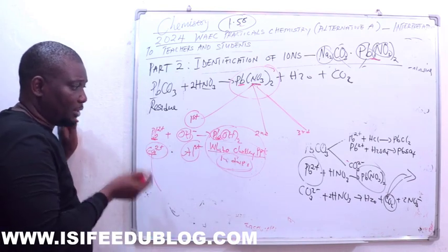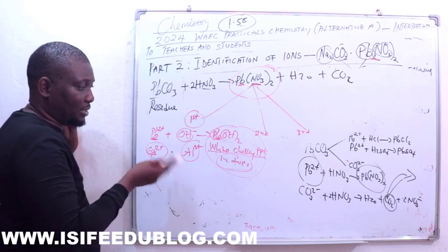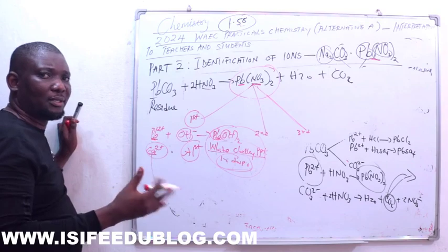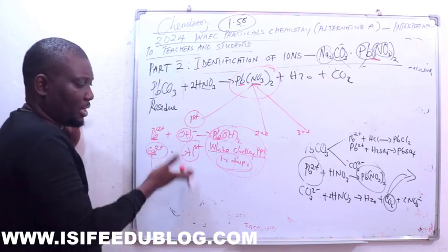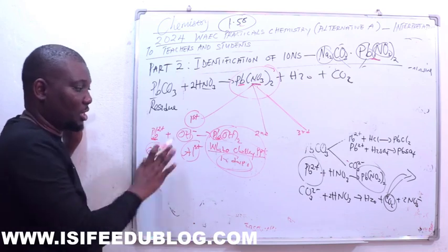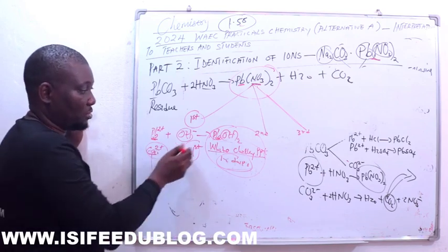Now, I wouldn't want to put zinc in the picture. Why? Because since it's chalky, zinc is like gel. So zinc should not be there. But I'm going to allow aluminum, with traces of aluminum in the chalkiness. We're keeping aluminum in this case, so these are three of them.